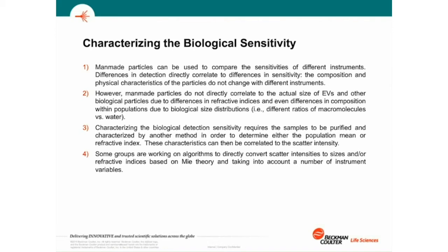Some groups are actually working on algorithms to directly convert scatter intensities to size and/or refractive indices based on Mie theory and taking into account a number of instrument variables.